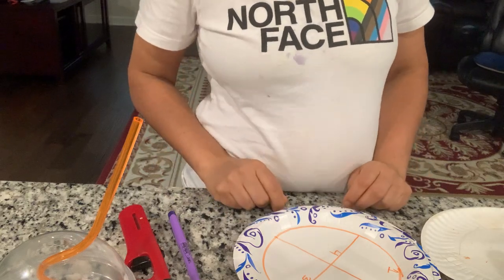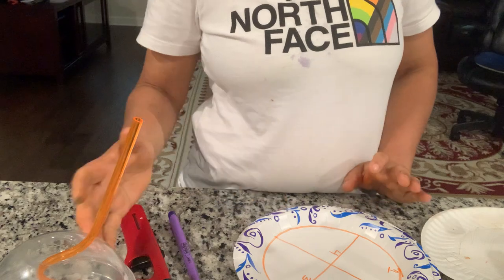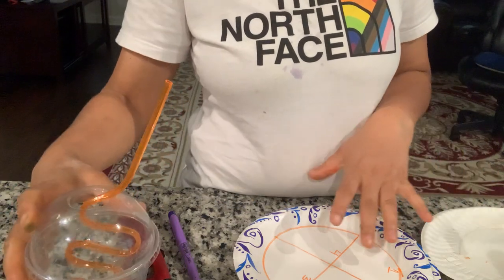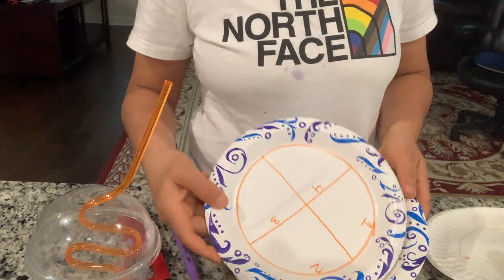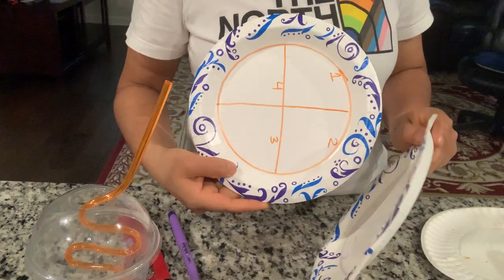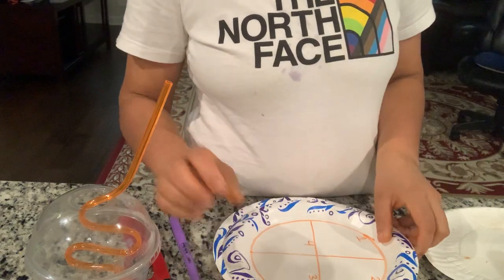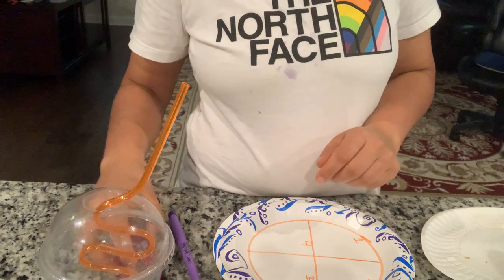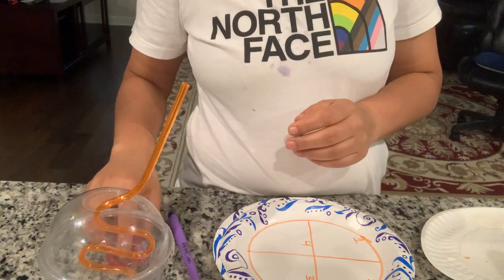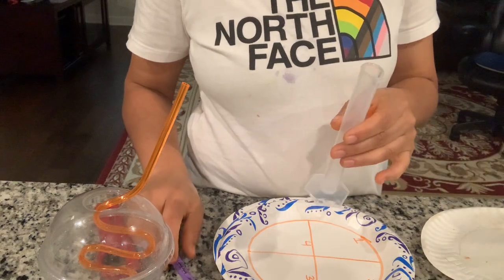Hi everyone, today I'm going to show the quadrant isolation streak method using household items. I have an agar plate here with my lid and a label on the back. This is my Bunsen burner, this is my lighter, and this is my loop.